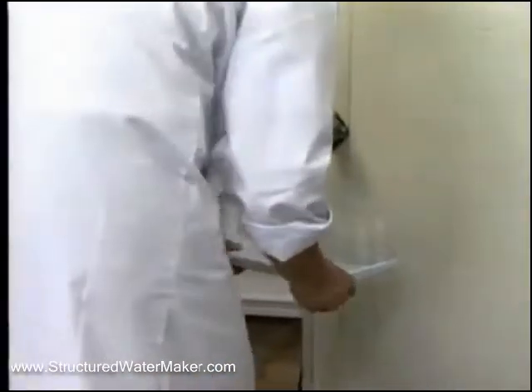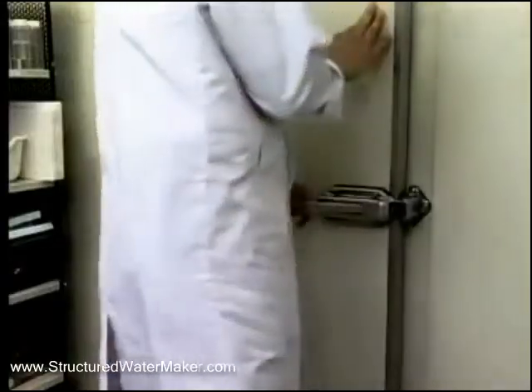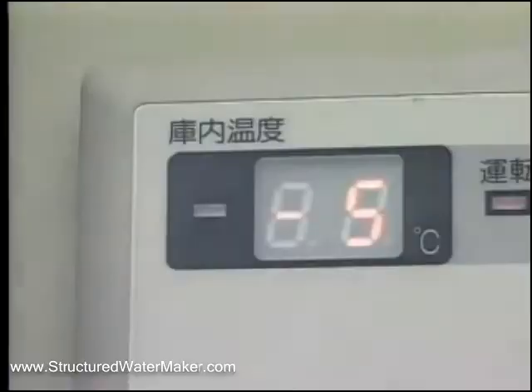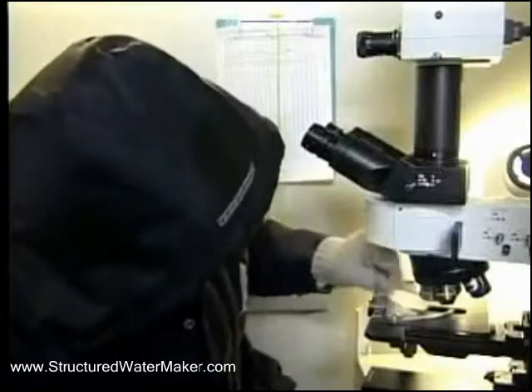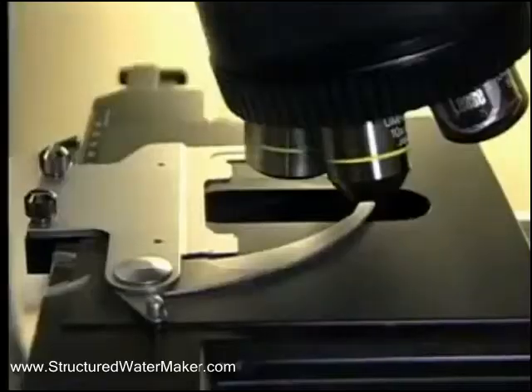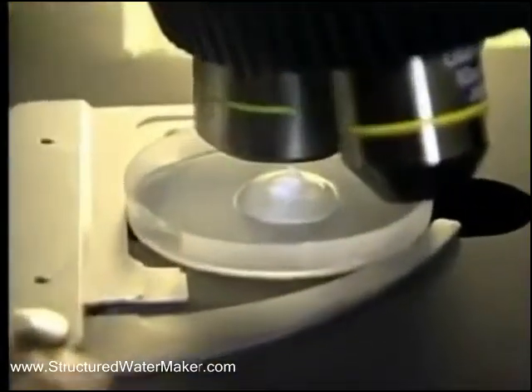The petri dishes are placed inside a freezer in the laboratory and frozen at -25 degrees centigrade. The crystals are then examined inside our laboratory, where the temperature remains at a constant -5 degrees centigrade. 3 hours later, we examine the tip of each ice block by illuminating it under a microscope.